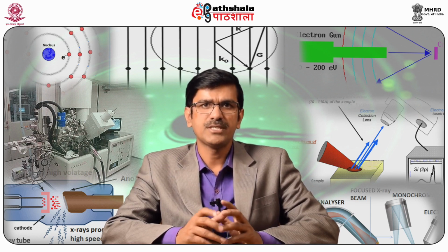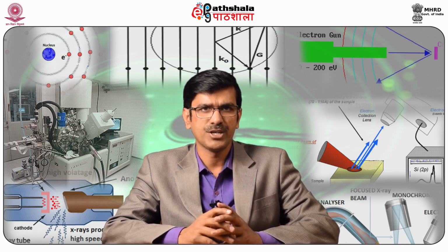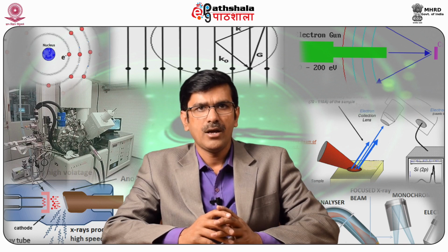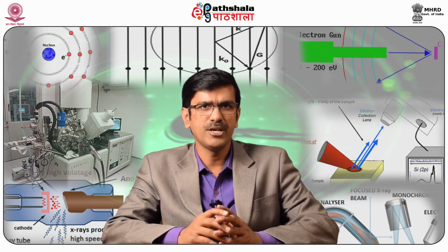Surface modification treatments are often in the range of 10 to 100 nanometers thickness. Higher than 100 nanometers can be thought of as the bulk. Surface analysis encompasses techniques which probe the properties in all these ranges.